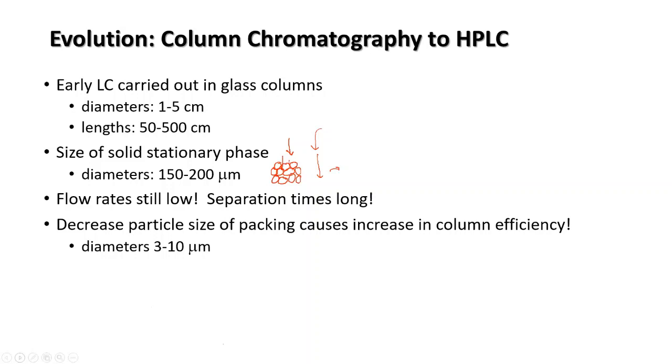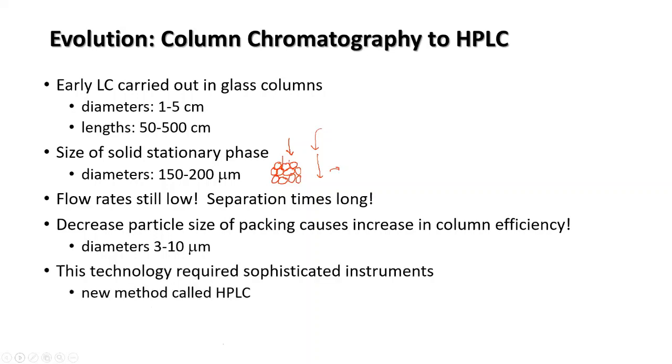But the biggest problem here is that your solvent will not move so fast, because you are decreasing the particle size. The gaps between the particles are decreasing, so the solvent cannot move easily. So this technology requires sophisticated instrumentation, and this new sophisticated instrumentation has been discovered and is called HPLC.